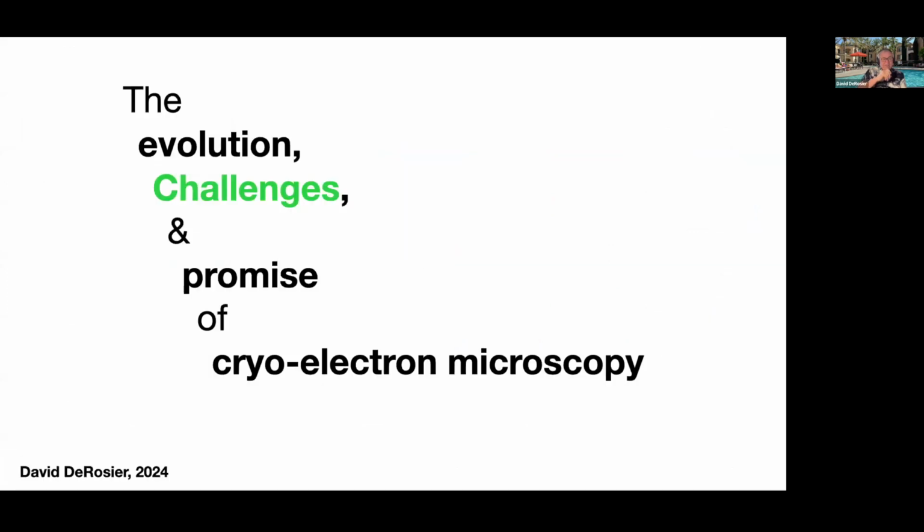Now, I had originally called this deficiencies of electron microscopy, but these days people don't like deficiencies. They prefer to call them challenges. So I've now switched it to challenges. The electron beam is damaging, and you can control this by controlling the dose. Under focus, phase contrast, and astigmatism affect amplitudes and phases.